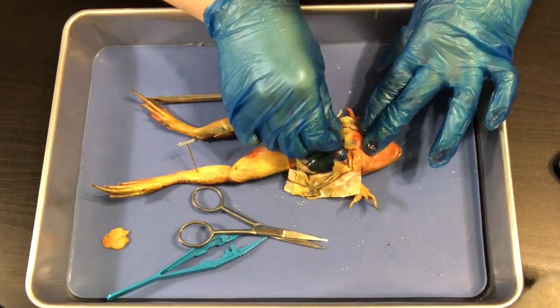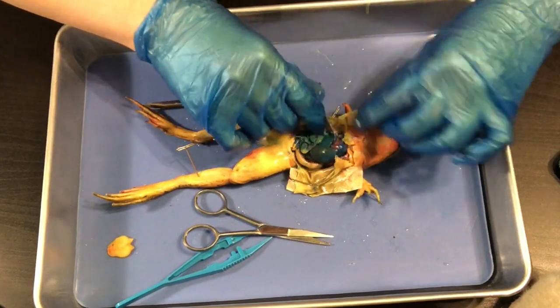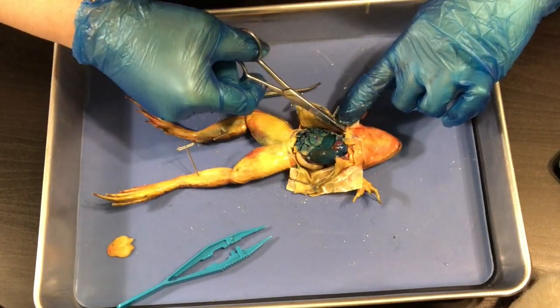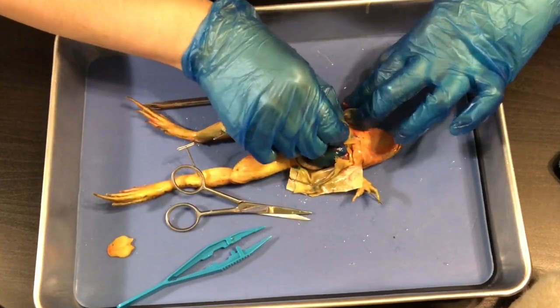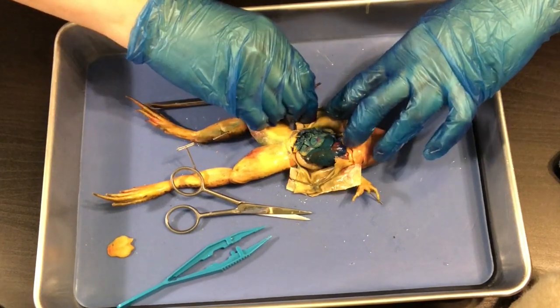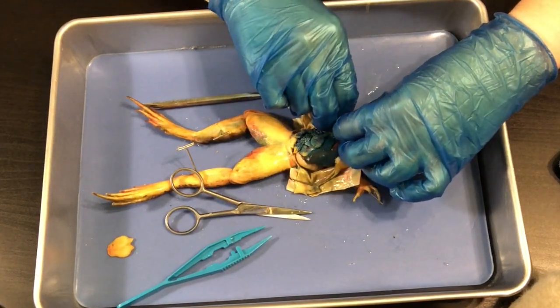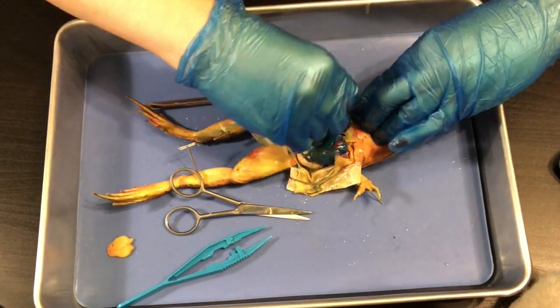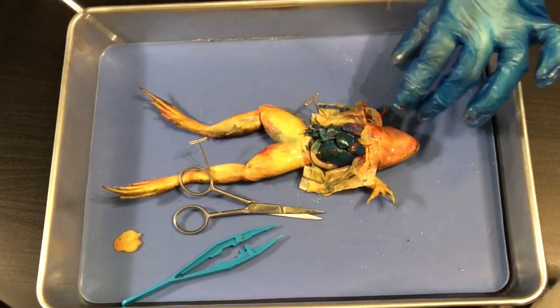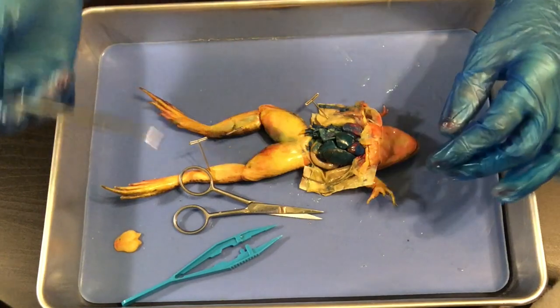I'm pulling on it, kind of yanking, and I've got some blood vessels hanging on there so I'm snipping those. I'm pulling across and using my pin to hold this open. I'm also going to hold this down along with the arm. Here is the inside of our frog — exciting! Let's point out some of the structures we see inside.